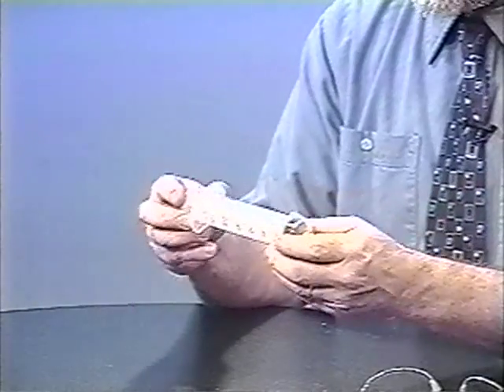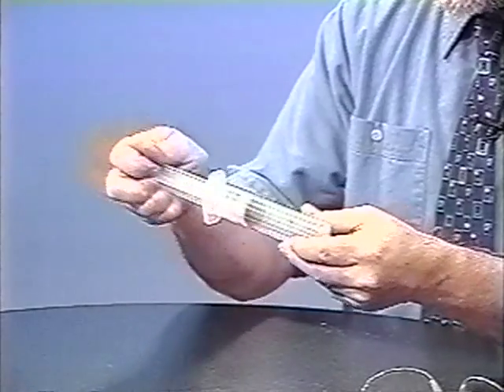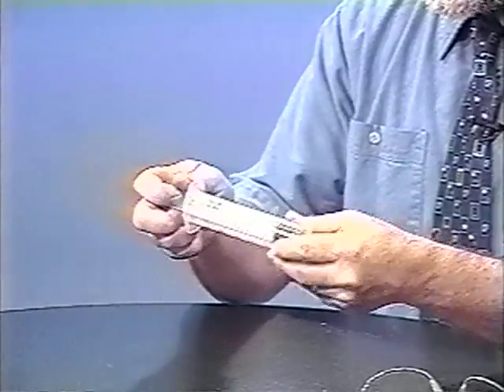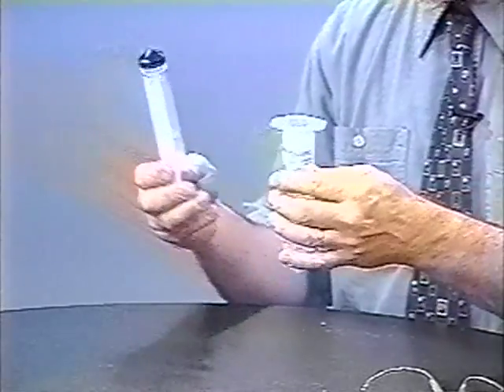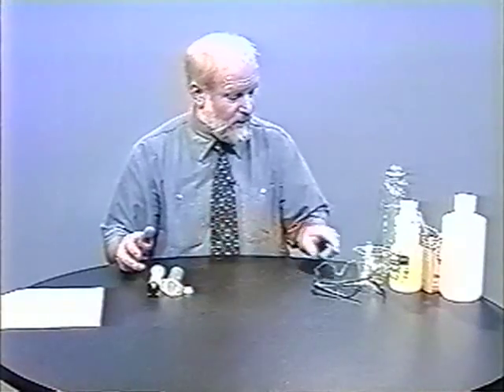Just throw that away too. The plungers are kind of stiff at first. You may want to loosen them up a little bit, and the plungers pop out like that. The other equipment you'll need includes a little vial cap. These come from vials, and we throw away the glass part — just use the vial cap.